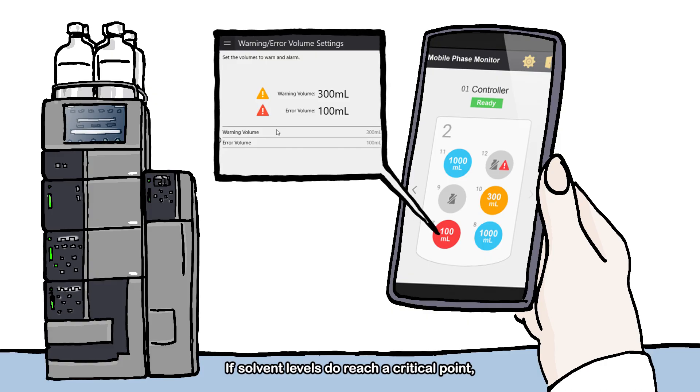If solvent levels do reach a critical point, mobile phase monitor will stop the analysis, saving the system from running dry, and preventing maintenance and downtime required for system recovery.